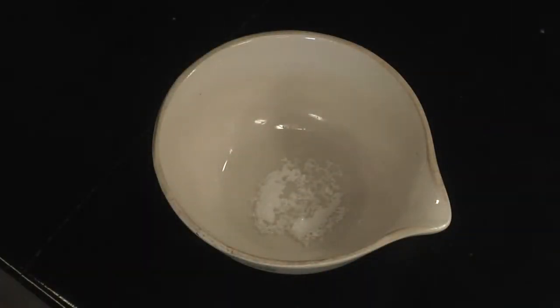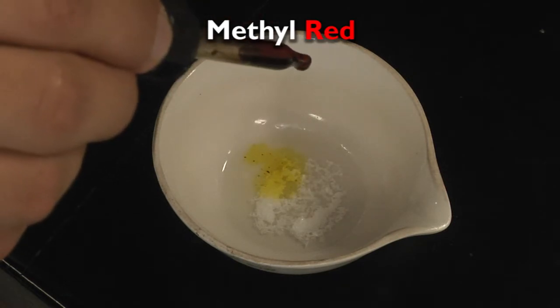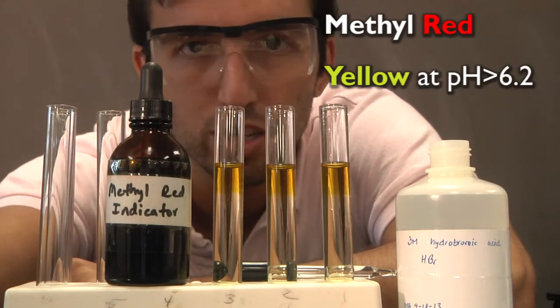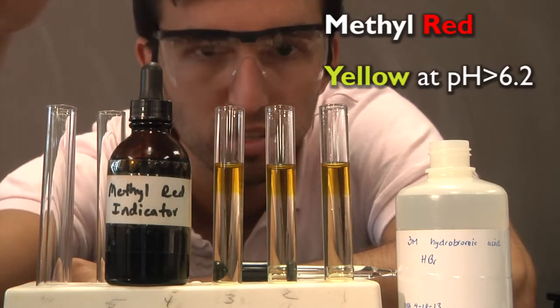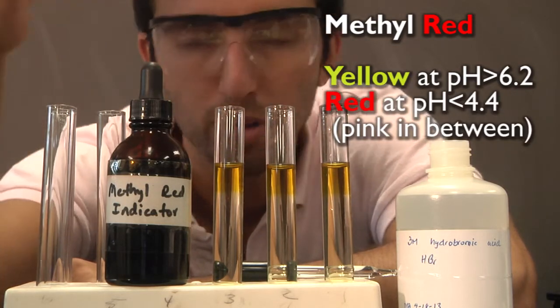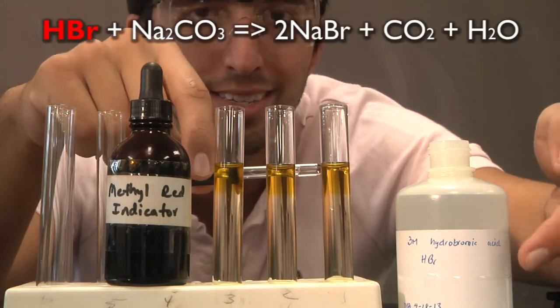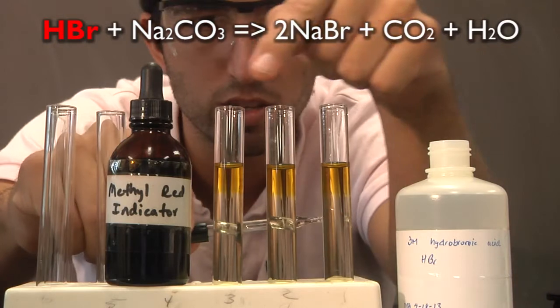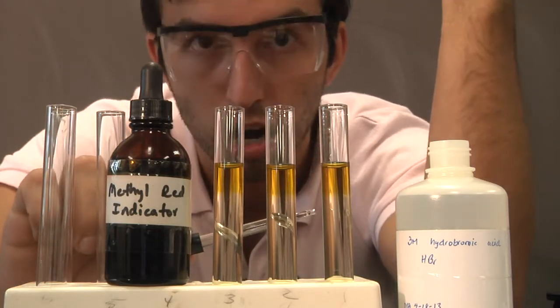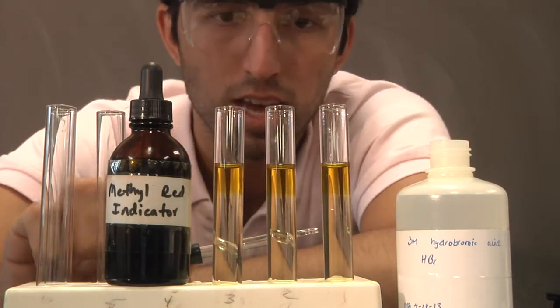Now we're going to add approximately two drops of methyl red to our mixture. Methyl red is yellow at pHs above about six, and turns red at pHs below four or below five. What I've got here is hydrobromic acid — a very strong acid — and all three of these are mixed with water, which is around pH seven. In Charleston it's around pH eight, so that's why we get a yellowish color.